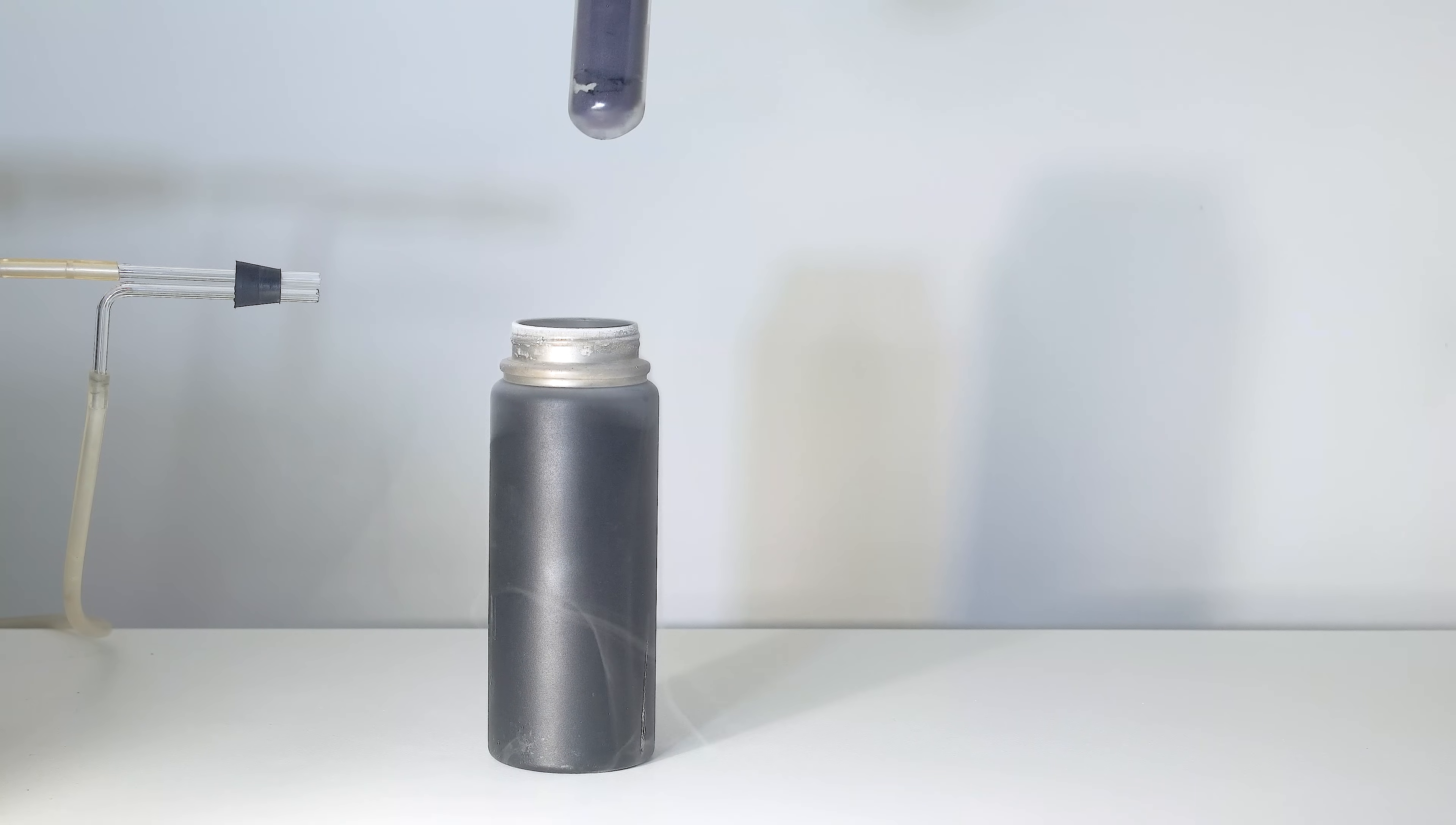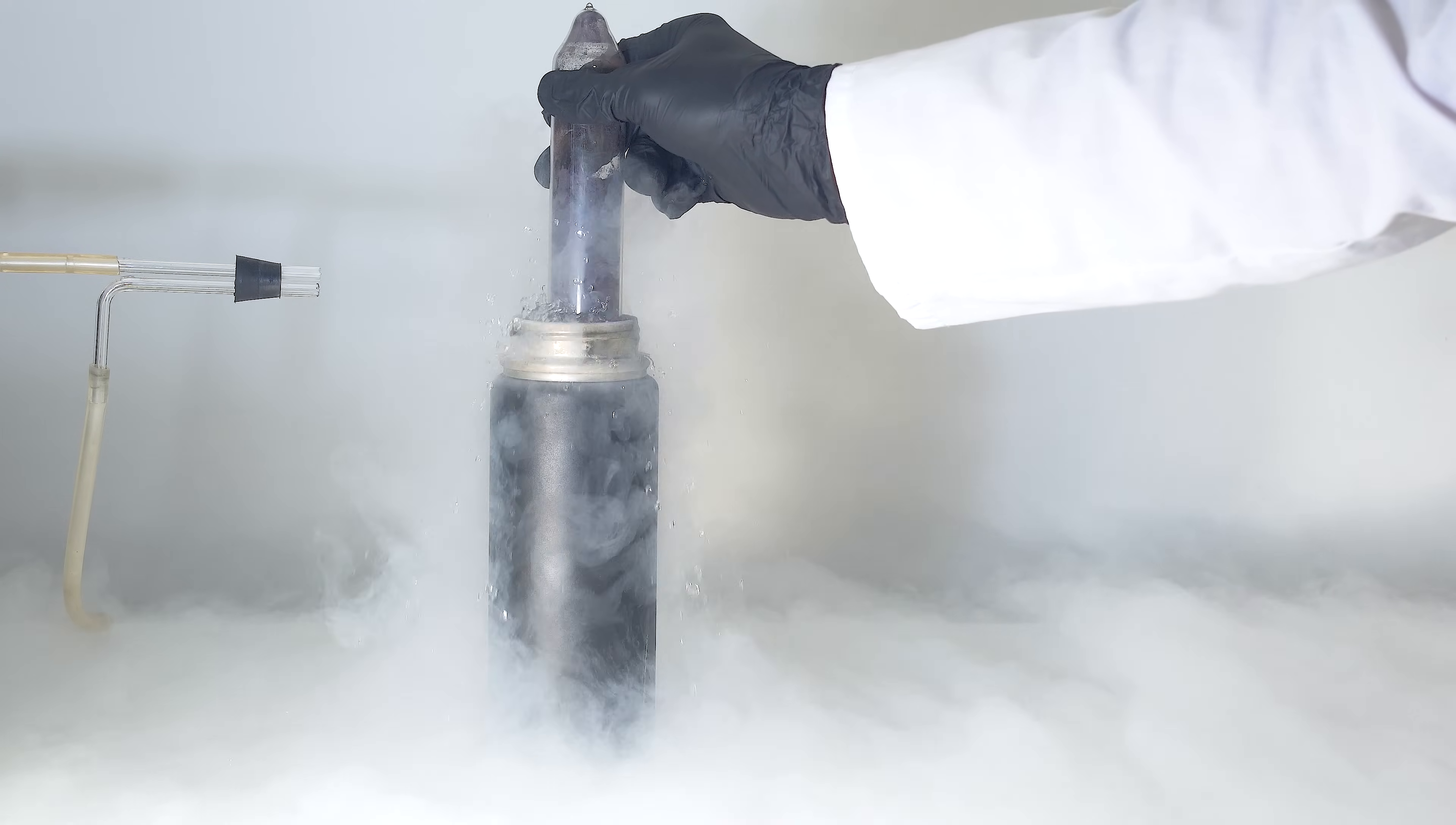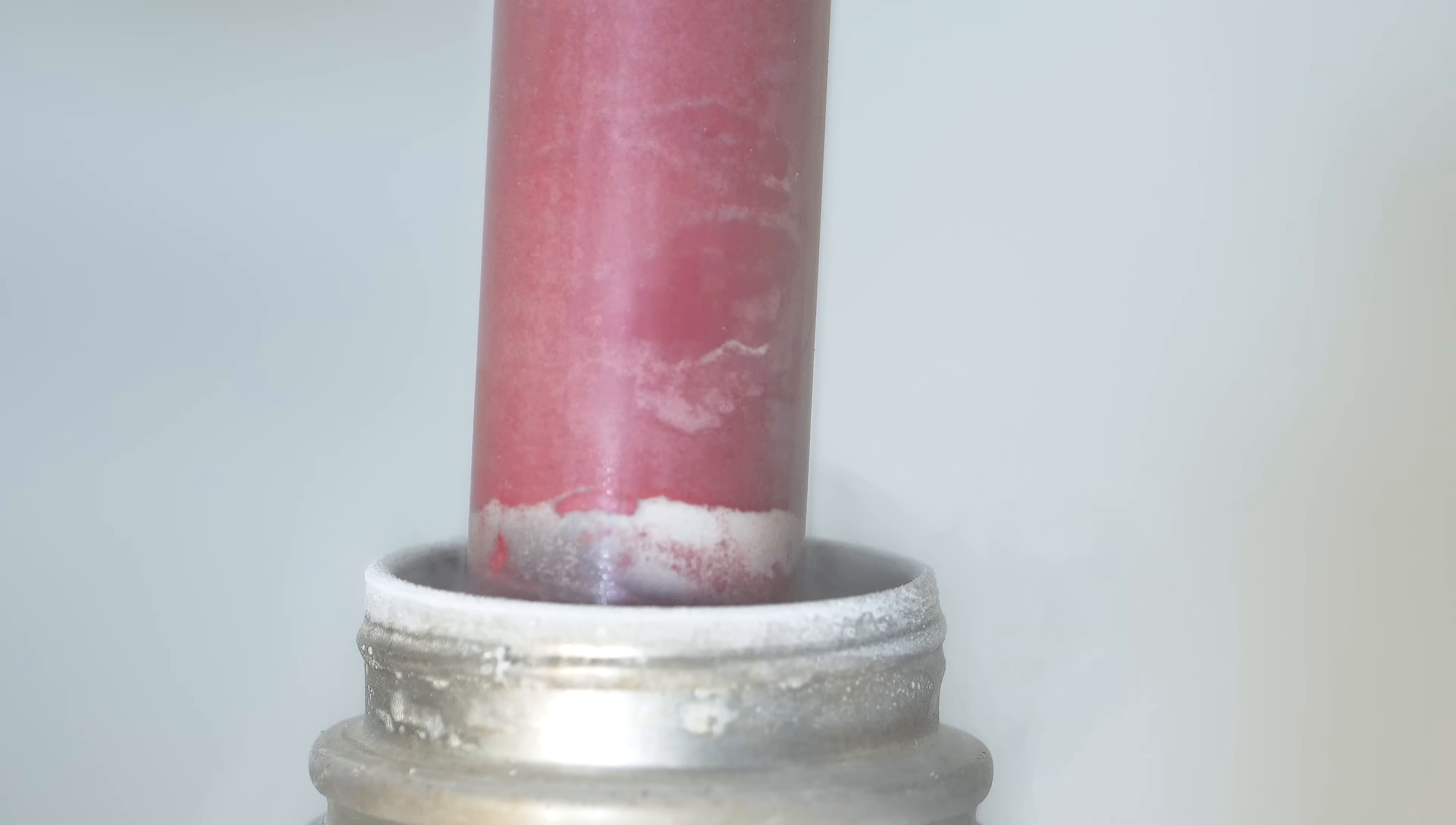This dark purple crystalline substance turns red when cooling in liquid nitrogen. This color is only retained at extremely low temperatures. If the ampoule is removed from liquid nitrogen, it quickly returns to a dark purple hue.